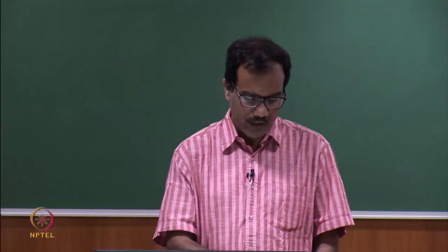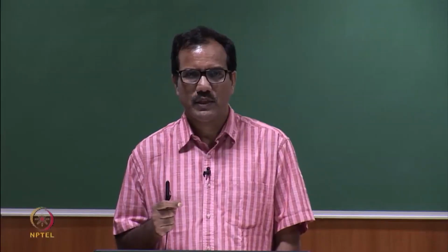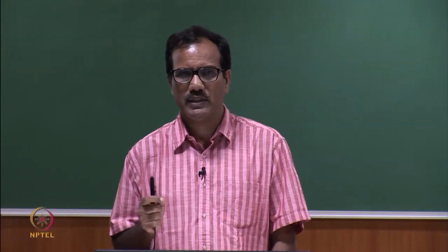Time resolved measurement, whether performed in the time domain or in the frequency domain, provides information about the intensity decay of the sample. Samples with multiple fluorophores typically display multi-exponential decay.